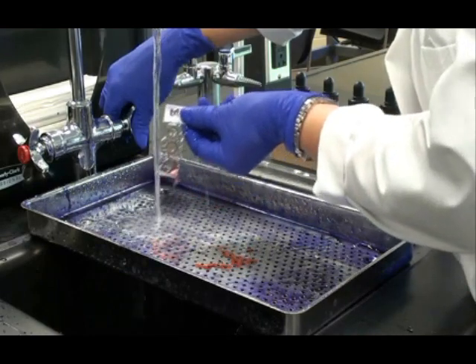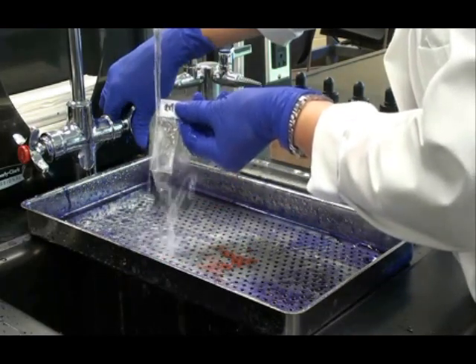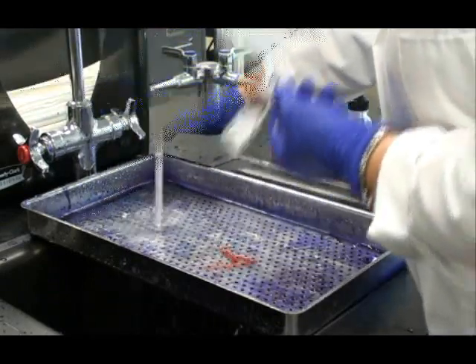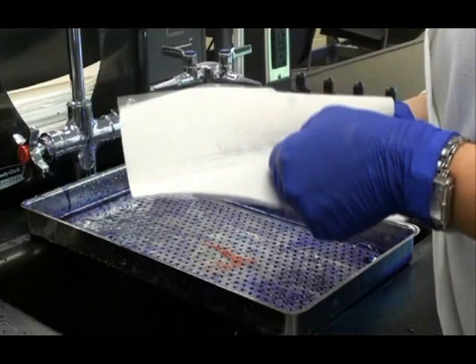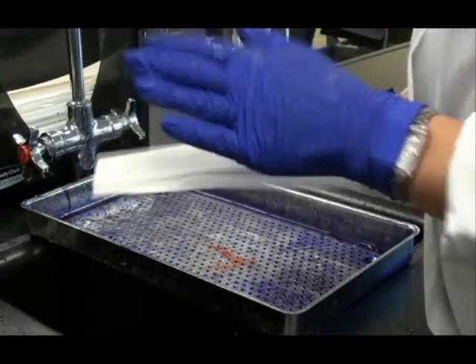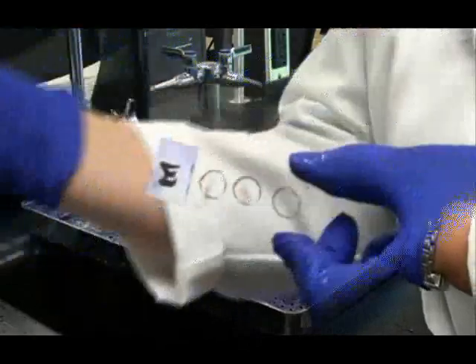Now it's time to rinse the safranin off of my slide. After rinsing I'm going to gently blot that slide dry. Don't rub the slide or you can wipe off the bacterial smears — just gently blot. And here's my finished slide.